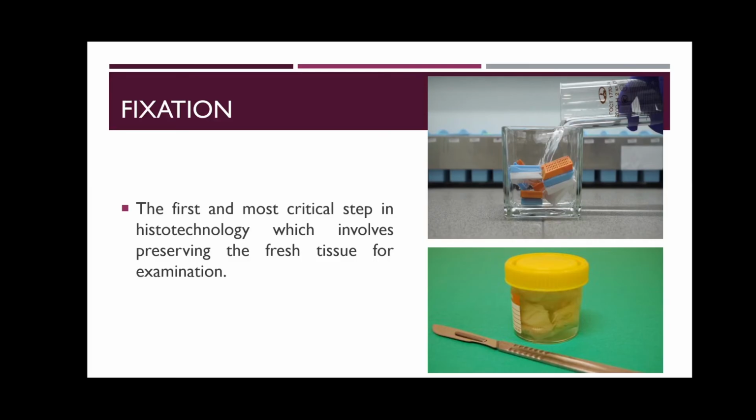The most common fixative that we use in the laboratory in Cebu Doctors University Hospital is the neutral buffered formaldehyde, or otherwise known as NBF, neutral buffered formalin. So kindly write that down.